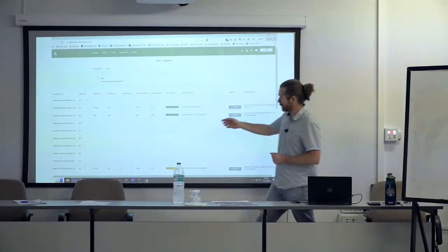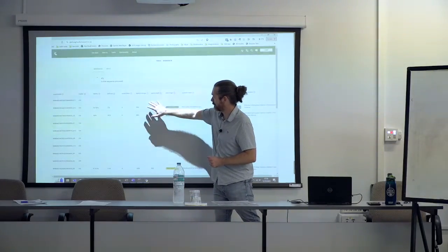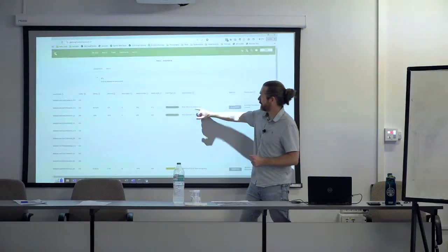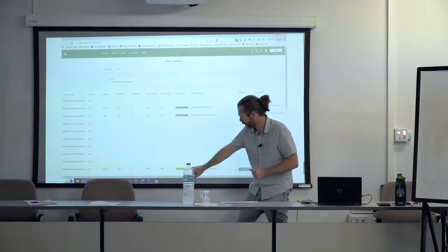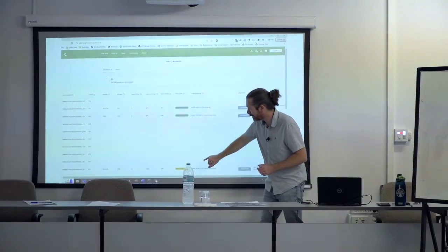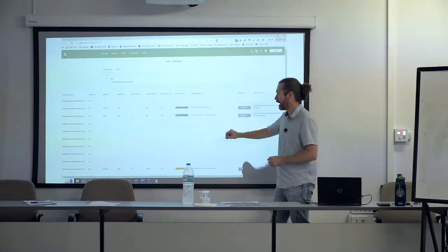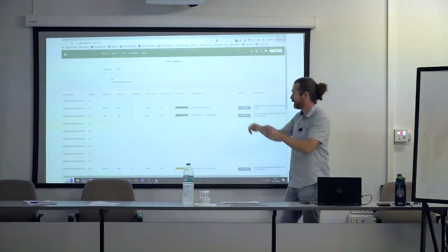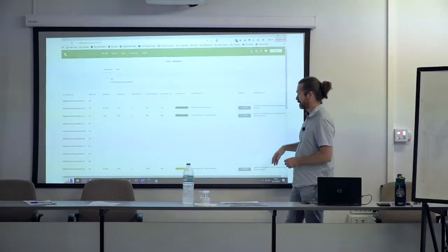It's doing a blast, so it has all the regular values you get from blast, like bit scores and coverage and length and all those sorts of things. It comes back with the scientific name of the match. It's got different types of matches, like a close match here if it's below a certain threshold. In this case, it was a 97.8% match, so it says it's a close match. These are 99.7 and 100% matches, so it's an exact match. And then it spits out the taxonomy of what it's matched against.